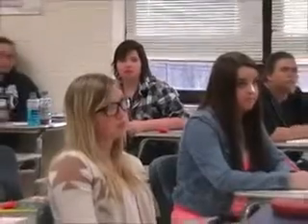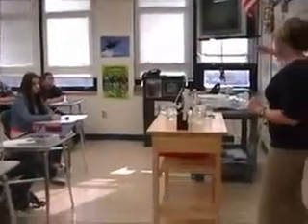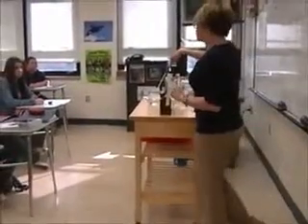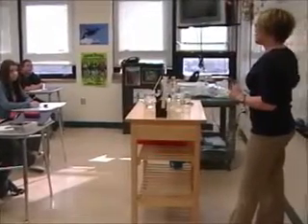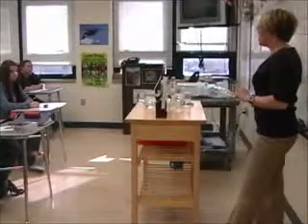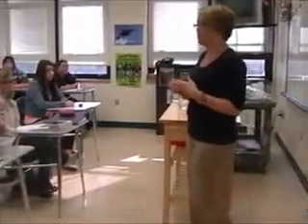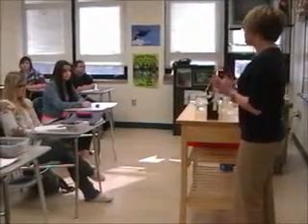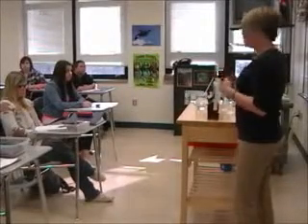Sure, and this temperature right here is probably not hugely accurate because you're right. I actually poured it into that graduated cylinder, which was kind of warm, and then it sat here for a few seconds. So this could be slightly warmer than 5. Probably if it was right at 5, this might have been even longer. Yeah, that's a good point though. And that's just something about experimental design that sometimes we have to think about that leads to a little bit of error in our results. That happens all the time in science. But that is a good pickup.